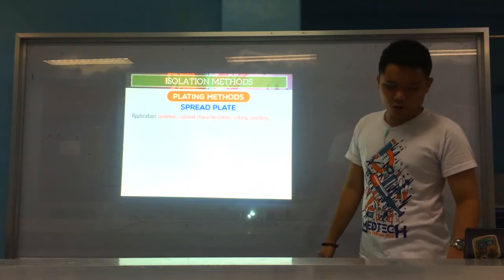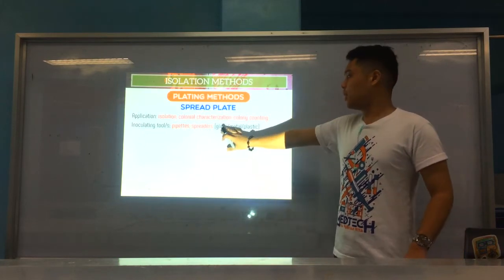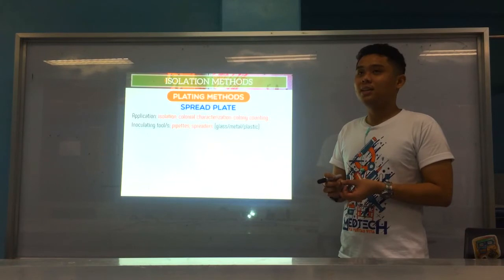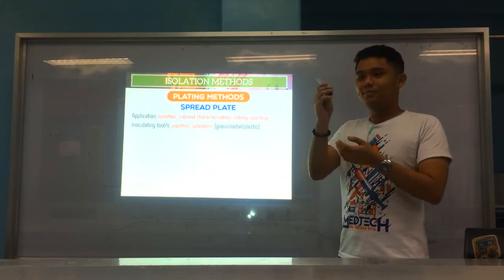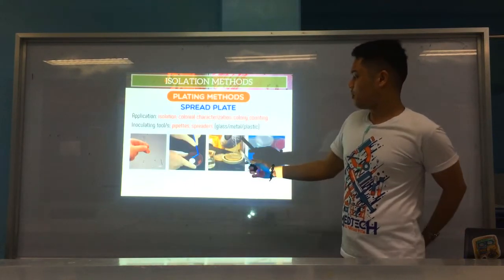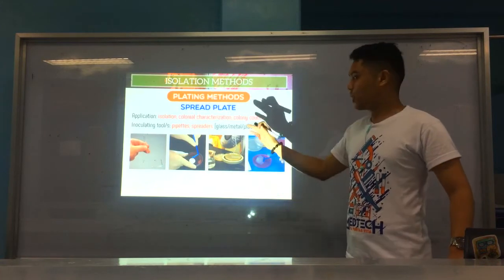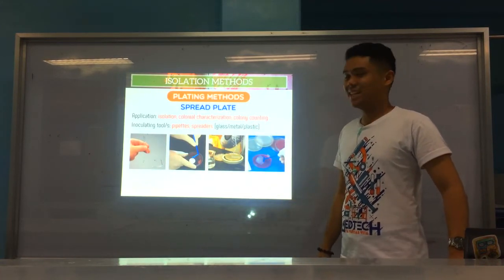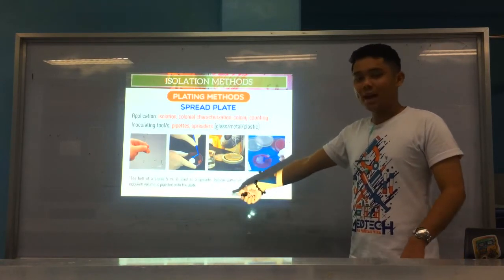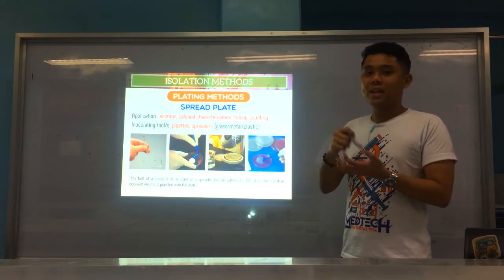Still the same for colony characterization or colony counting. What we use are pipettes or spreaders. Here in AK, in the lab activity, the spreader we use is the butt of a tube, like a 10 ml or 5 ml tube, for the spread plate. In other bacteriology labs, they use a plastic spreader. Okay? But again, that's for colony counting and colonial characterization. That's for spread plate. Okay? Butt of a sterile 5 ml tube, and usually the technique or procedure we use is the same as in multiple overlap.